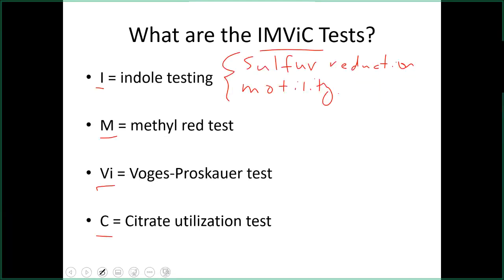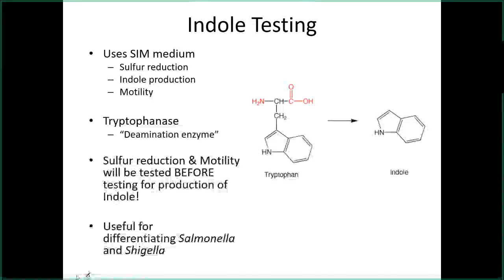So does the organism have flagella or not? That's another thing we can learn as part of that indole testing. Okay, so we'll talk about indole testing first.